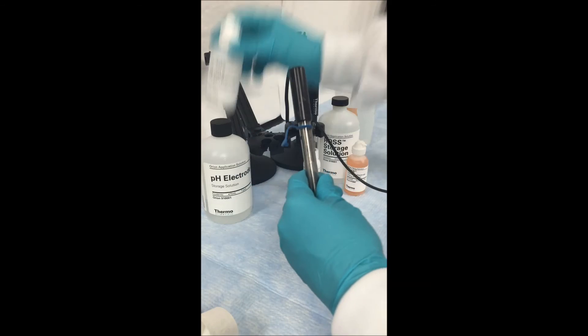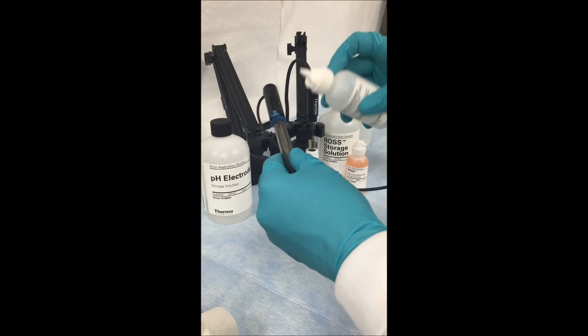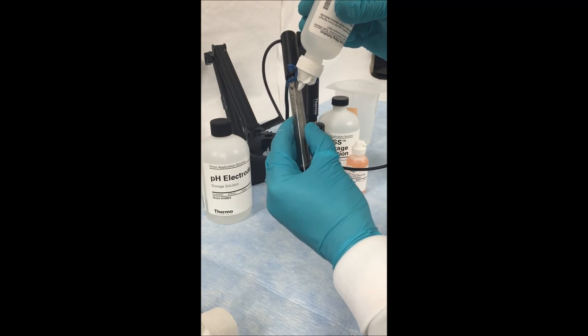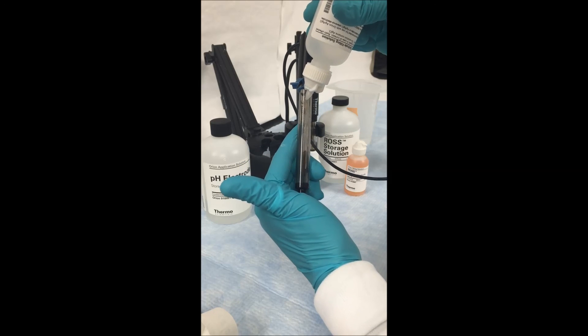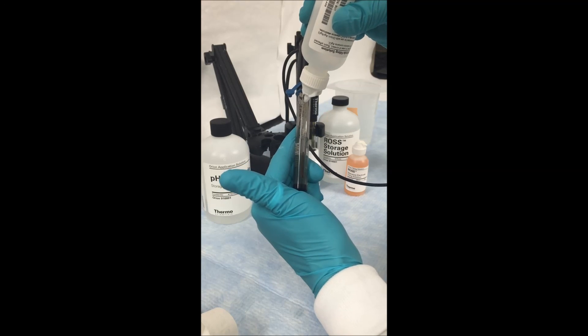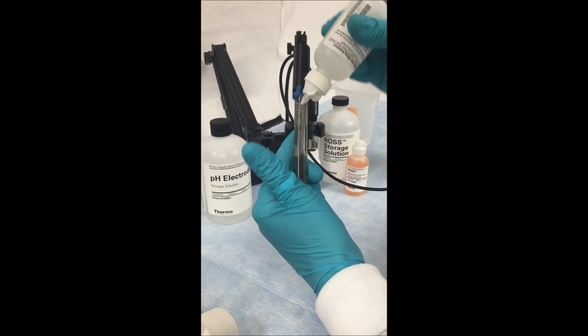Using the appropriate filling solution, fill the electrode by locating the fill hole on the side and filling it all the way to the top. Since this is a shore flow electrode, there is always a small amount of solution moving through the electrode, so you want to make sure that you top this off every day before using it.